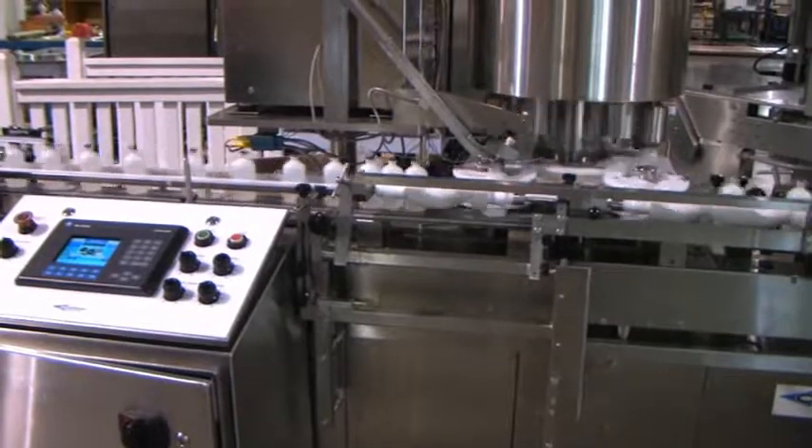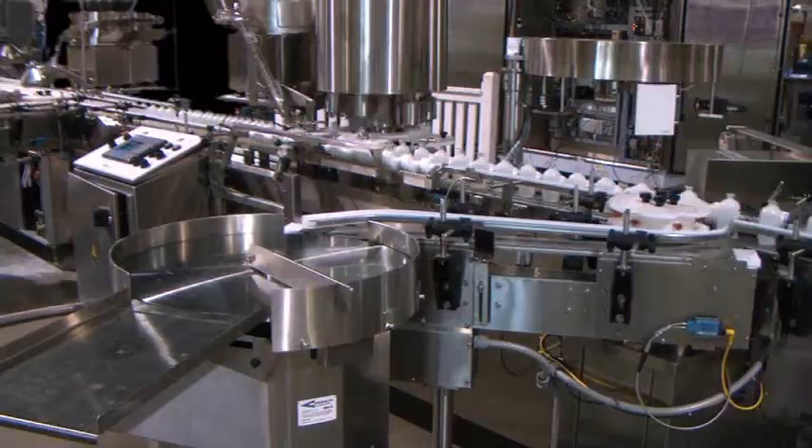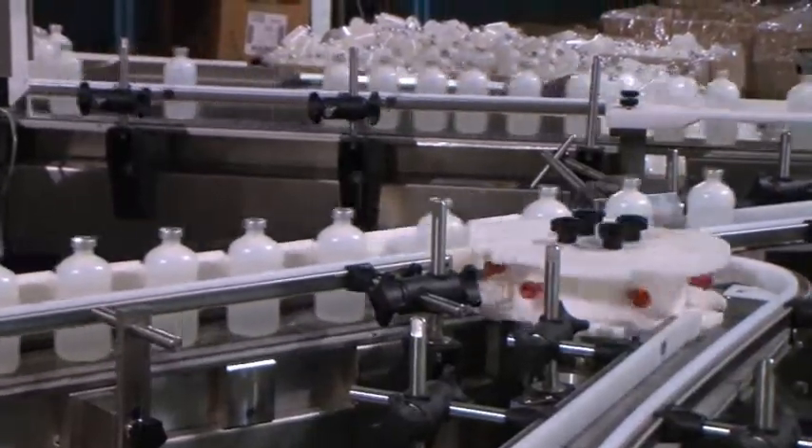The CM200 uses specially controlled pressure heads to provide quality seals. The second reject star wheel is used to remove bottles with missing crimps.